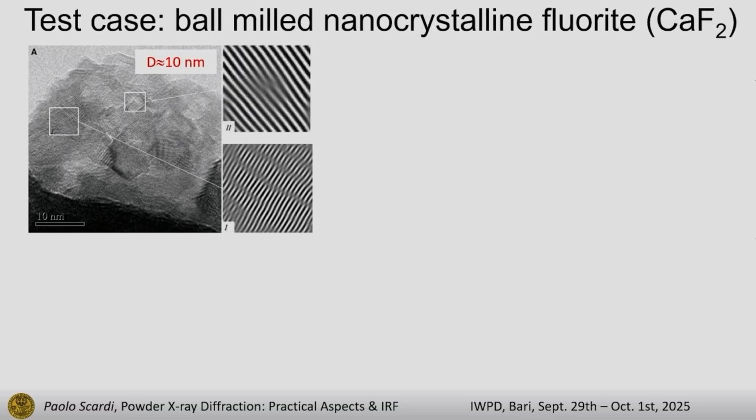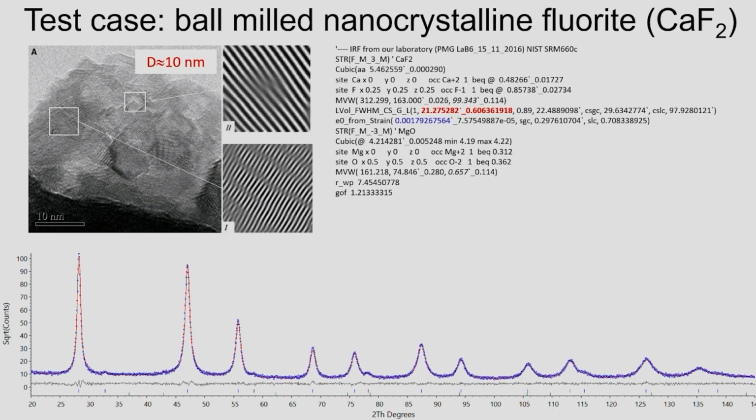So how did the double Voigt approach work? It gave a not bad fit, not bad. I like to use the square root intensity scale because this is coherent with the weight of the data. If you remember from my previous lecture, the standard deviation from the counting statistics goes with the square root of the counts.